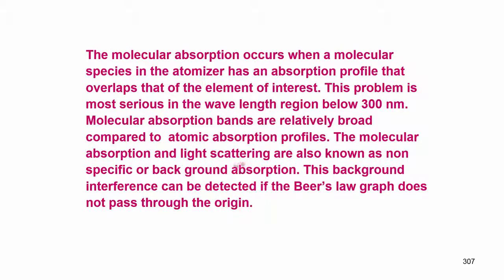This background interference can be detected if the Beer-Lambert calibration curve does not pass through the origin. In atomic absorption, you take standard solutions of 1, 2, 3, 5 ppm etc., measure the atomic absorption by aspirating into the sample, and plot absorbance versus concentration. If the calibration line does not pass through the origin, it indicates some amount of background interference.